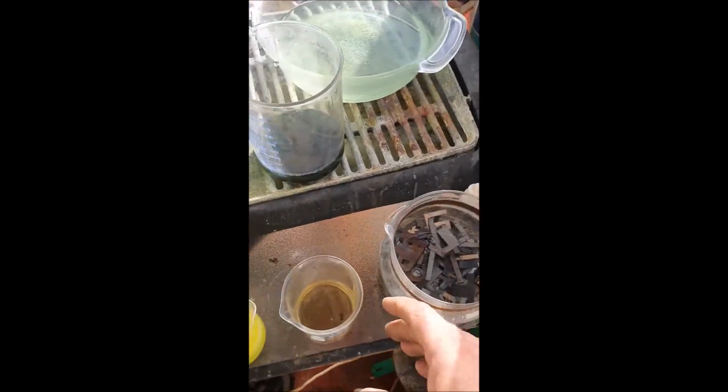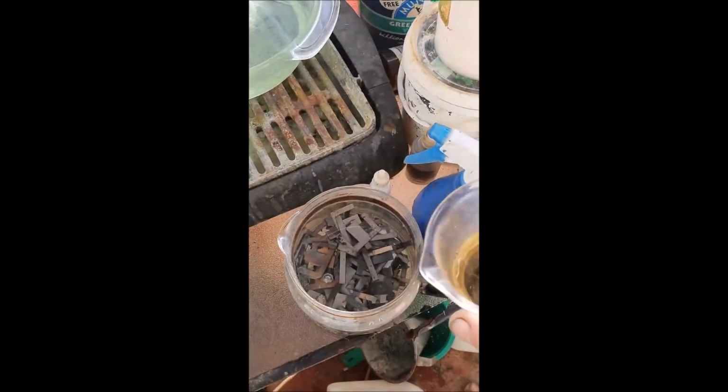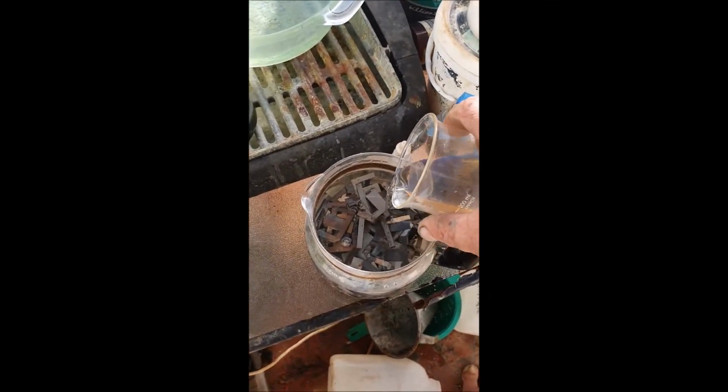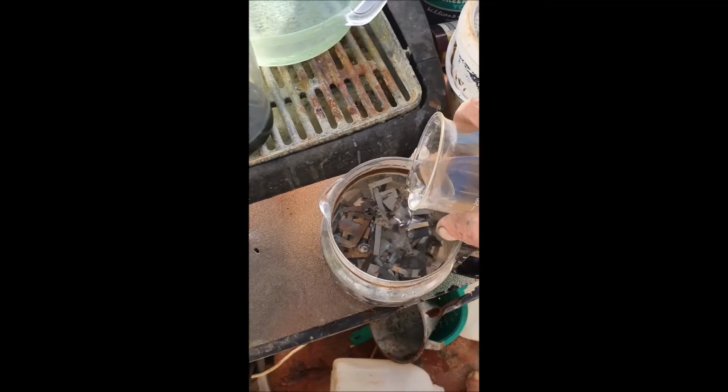So now what I want to do is put this sulfuric acid in with the water, gently. You always pour acid into water, not water into acid, because it's exothermic, so it'll have a violent eruption.